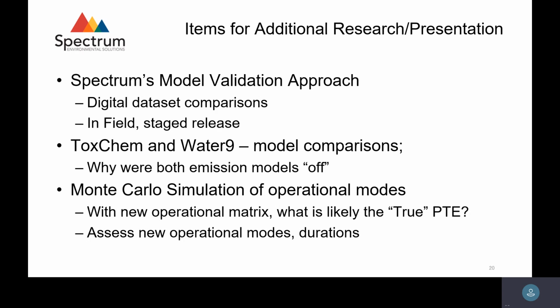So this was a unique application of FTIR. It's not just suitable for fence line monitoring. It can be used for flux, and there is now a way to do that. Now that the patent has expired, it's now open free range. So everyone can go out there and try to build this software if you want to attempt. It's not impossible. It did take us a considerable bit of time to work out some of the details.